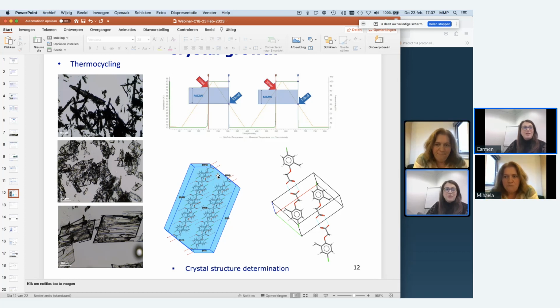Questions keep on coming, but I think I will take the last one. My problem statement is a bit of the inverse of the typical goal of crystallization studies. Rather than optimizing or maximizing crystallization, I am looking to understand how to prevent it. I have a neat resin that demonstrates a range of tendencies to solidify, and our customer does not want it to. Keep it liquid. Can you talk about the method development approach to more precisely determine onset across samples of neat resin and accelerate onset in a way that can be correlated?